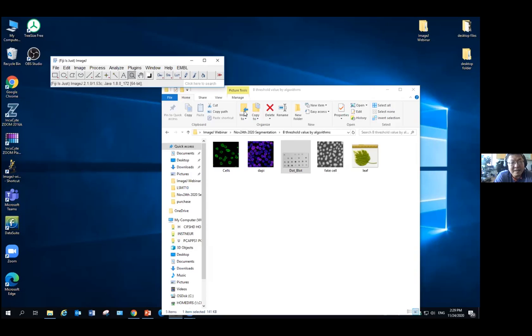So they may just have a different background value. It's not something you can control. You can make sure in the acquisition part that you use all the same parameters to get the image. But just because the samples go through different treatments, your experiment one may just have a higher background than your control group. So let's say I go to portion C.